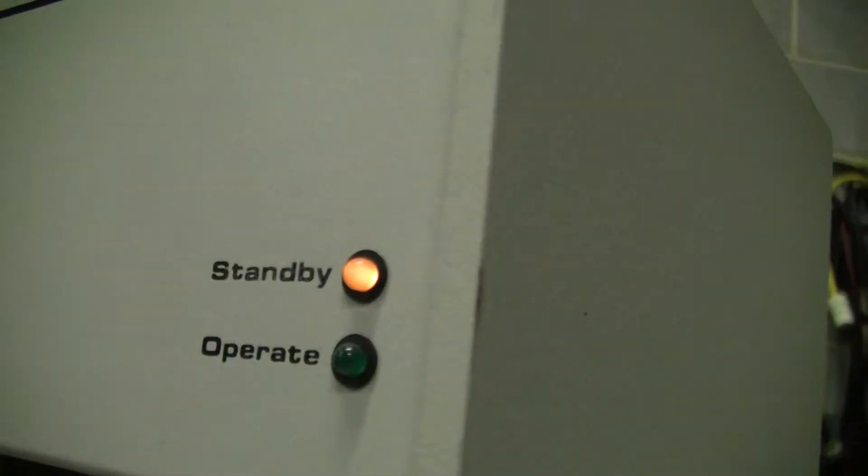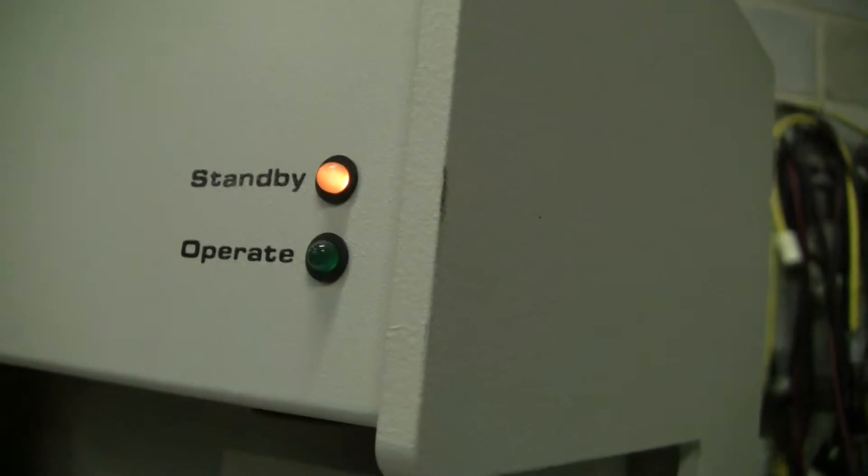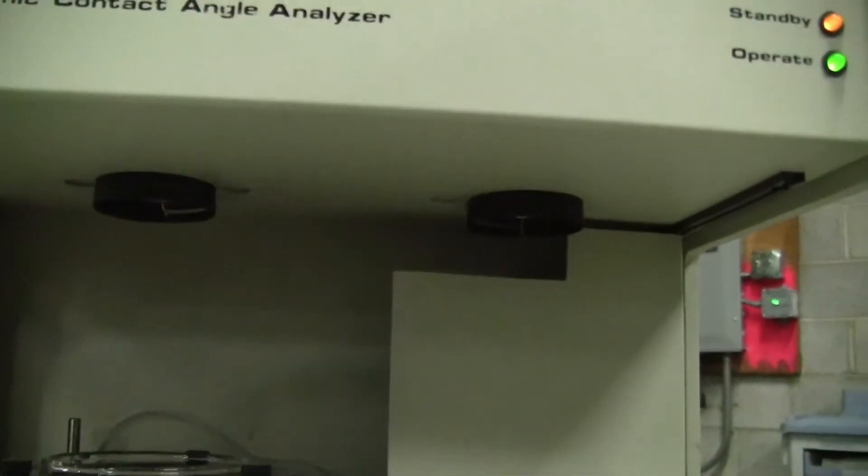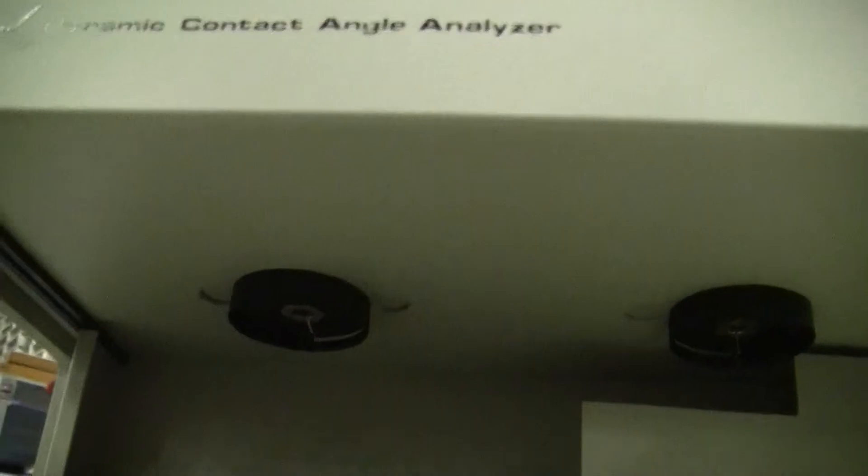Turning the unit on in the back. Now we have a standby light. I don't really see the rings doing anything but... We have an operate light that just came on. Hearing motors. And the rings are not moving as much.